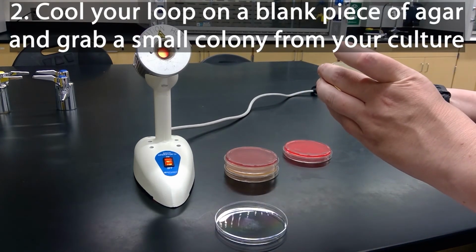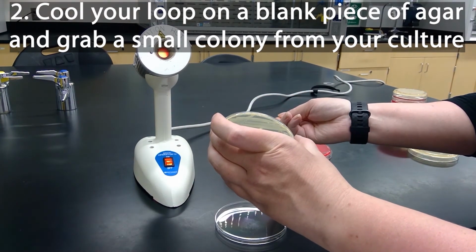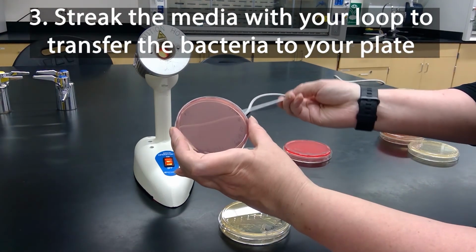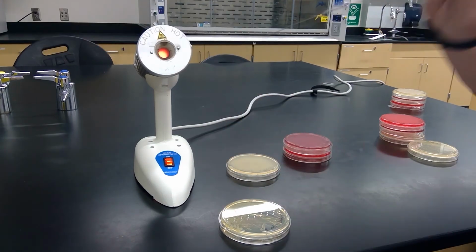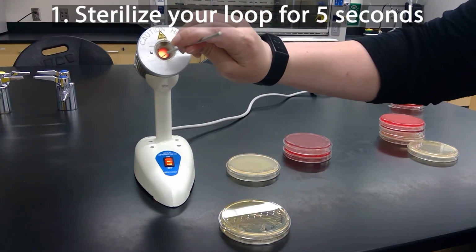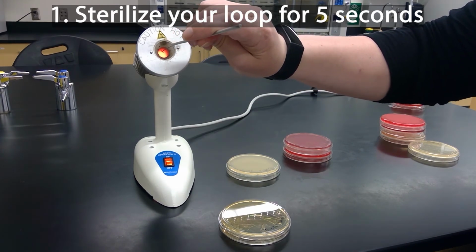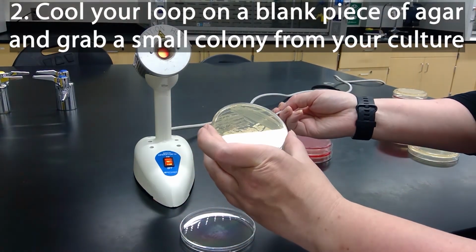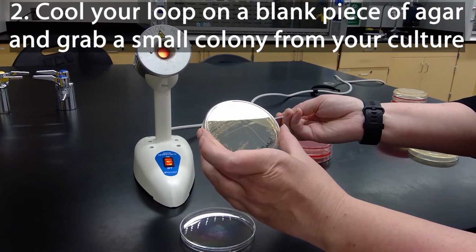And then we'll grab some culture, streak it onto our plate, and then sterilize our loop again. And then I touch it to a blank spot of the agar.